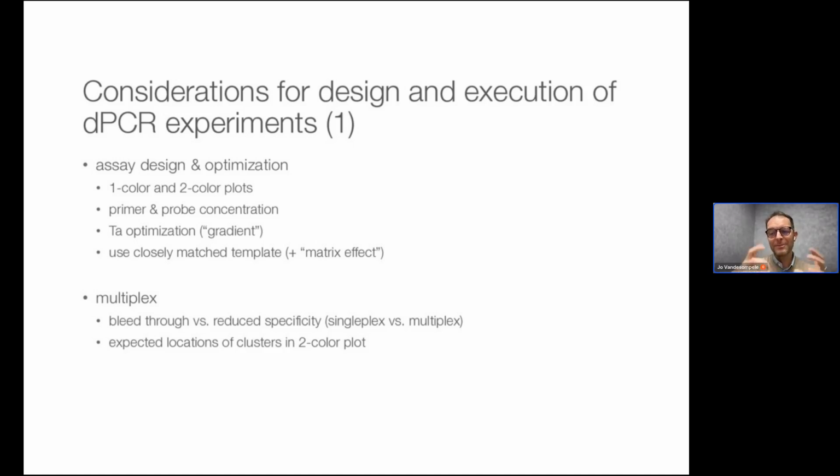So don't underestimate the matrix effect of the real sample compared to synthetic or contrived samples. A lot of information is actually embedded in that dMIQE paper.